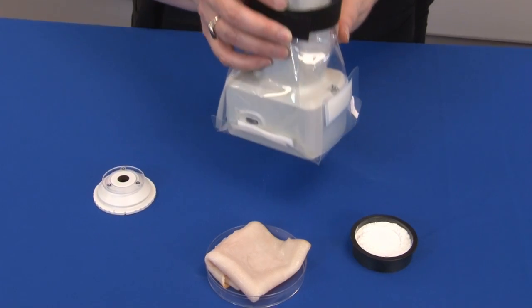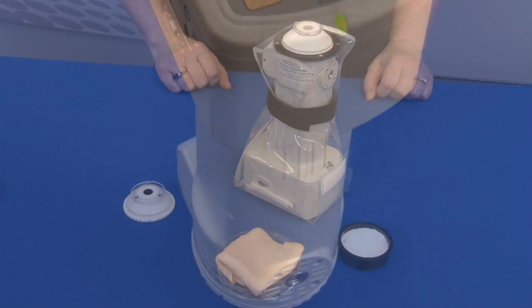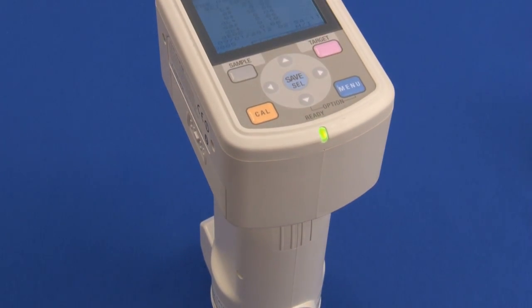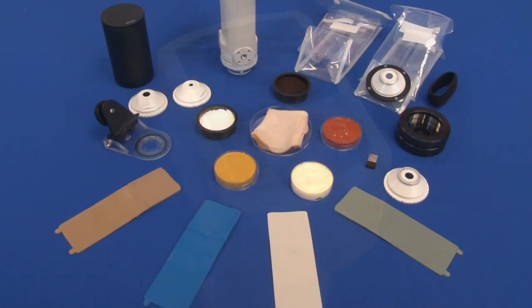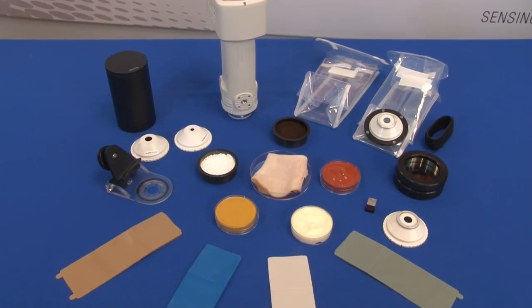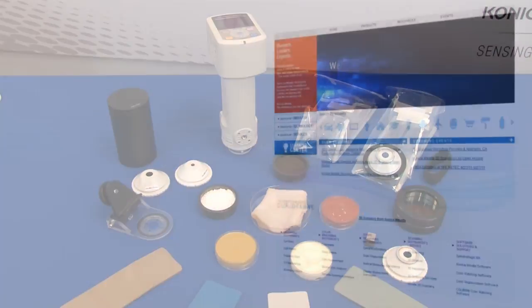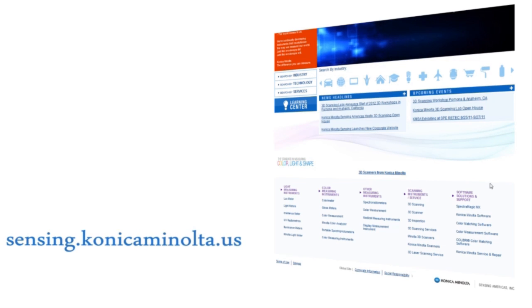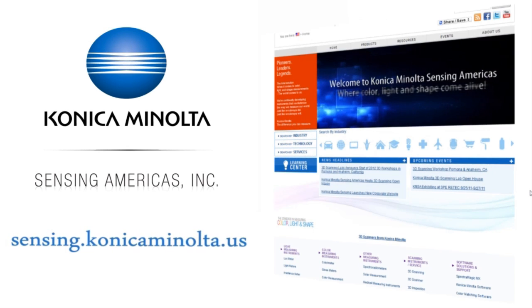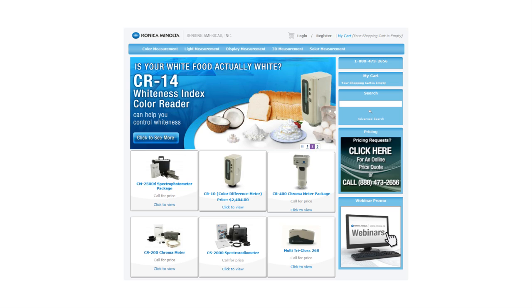Accessories are simple additions to your color measurement instrument for unique applications. For more information on Konica Minolta's color and appearance product line and accessories, please visit us online at sensing.konicaminolta.us or shop directly at shopkmsa.com.